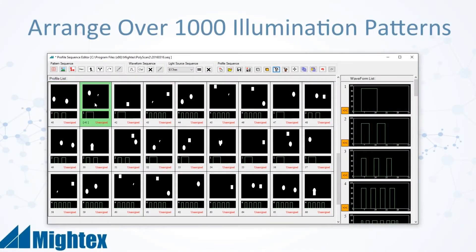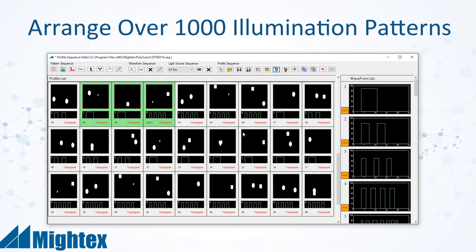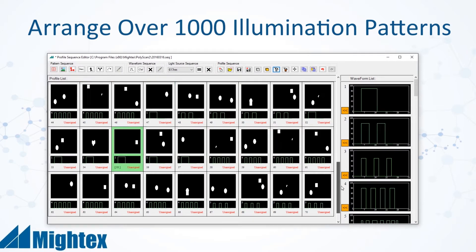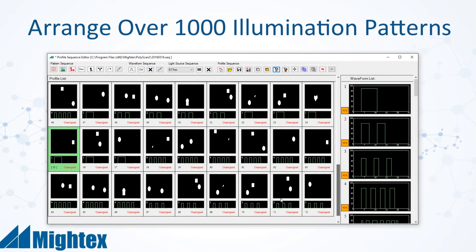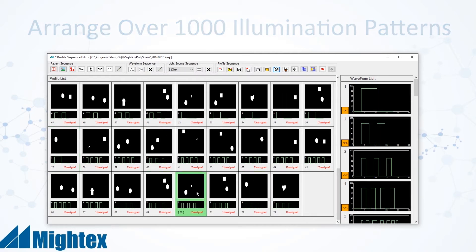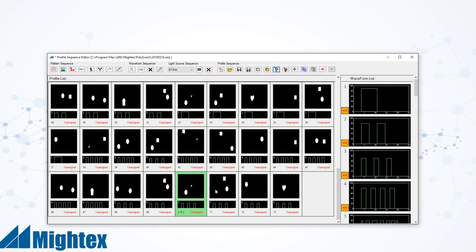Many experiments in fields such as neuroscience require multiple illumination patterns to be used sequentially, sometimes even hundreds or thousands at a time. PolyScan allows users to arrange and manage their patterns and sequences to accommodate these needs.